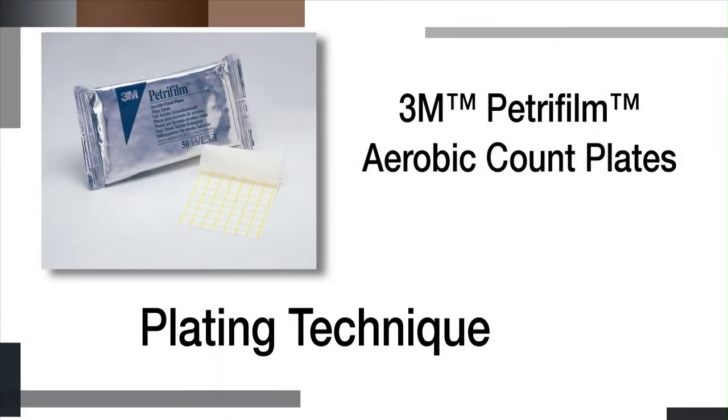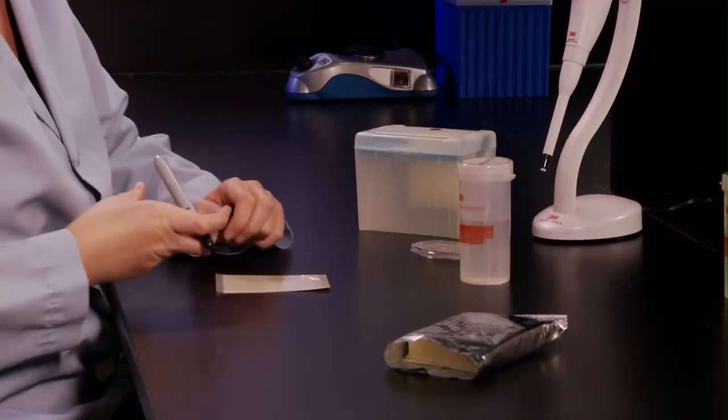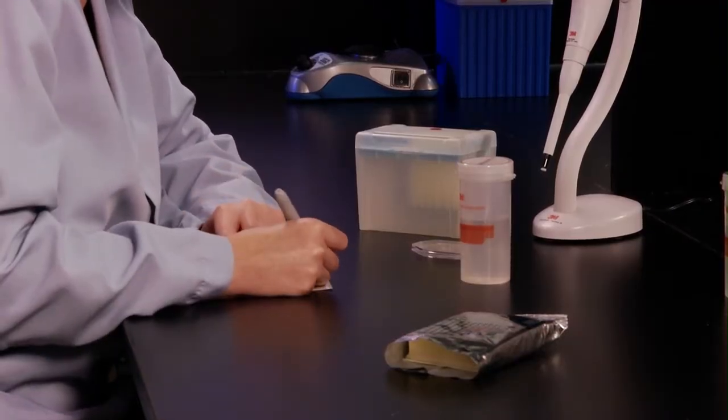Here is the plating technique for 3M PetriFilm aerobic count plates. Label the plate and place it on a flat surface.